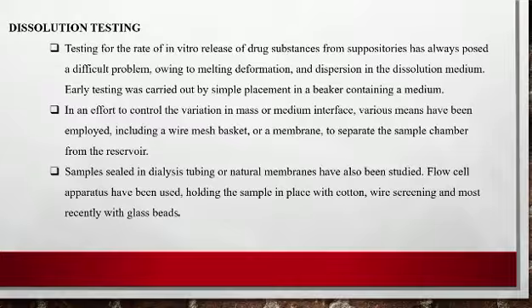Next, at regular intervals, we have to withdraw samples of the medium and replace it with fresh medium to maintain a constant volume. We analyze the samples using a UV spectrophotometer or another suitable method. From that we can easily find out the amount of drug released over a certain period of time. Here the plot of drug release versus time is drawn, and we can easily find the percentage of drug release at different time intervals. This is the dissolution testing.